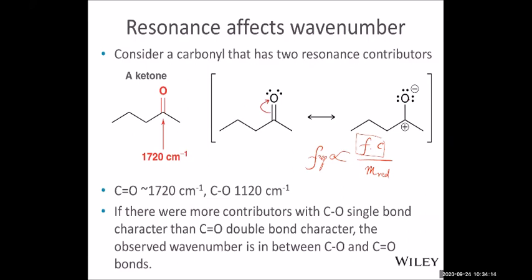And so it depends on, this is what we call the standard carbon-oxygen double bond, the carbonyl bond. We have such a frequency.